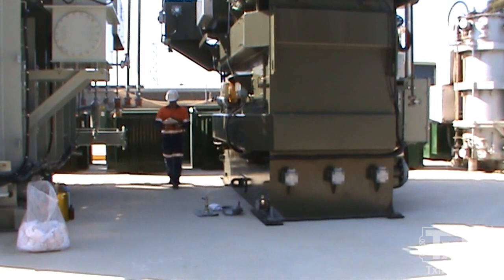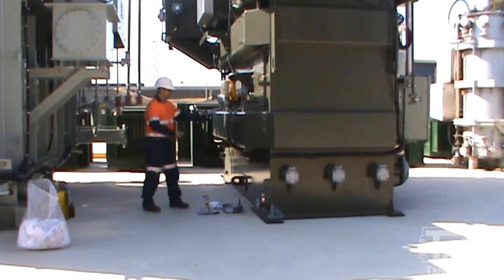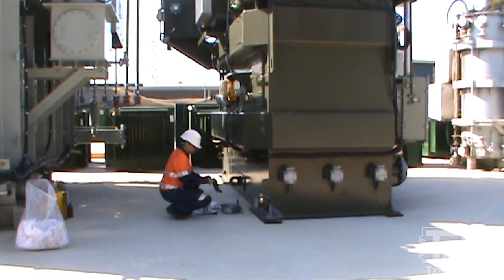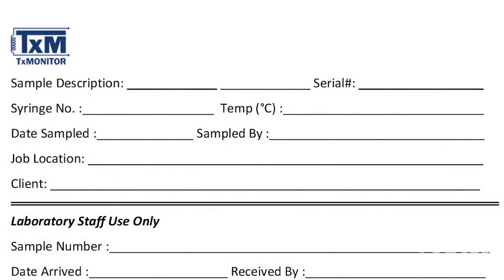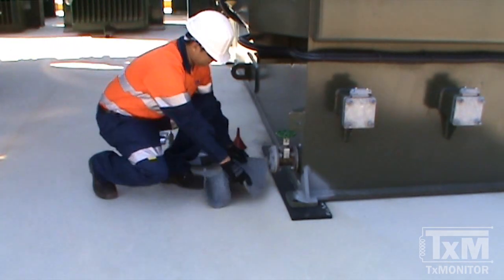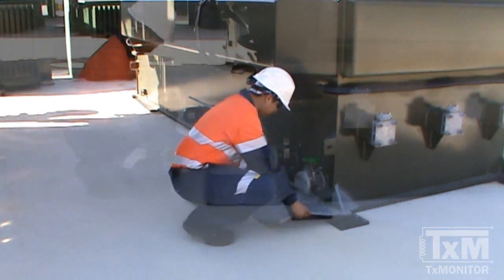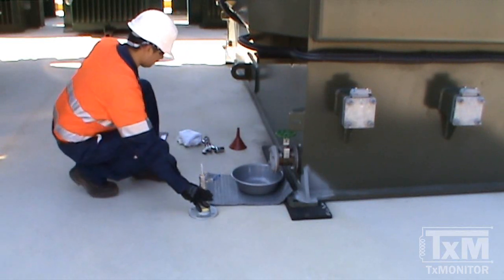To perform a bottle sampling, first we must identify the sampling valve that the sample is to be taken from. The recommended sampling point is the bottom drain valve. Once we have identified the valve, affix the sample bottle label to the sample bottle. Lay absorbent pads under the sampling point as required to prevent any spills or leaks from contaminating the ground. Place a container under the sampling point to capture any oil.